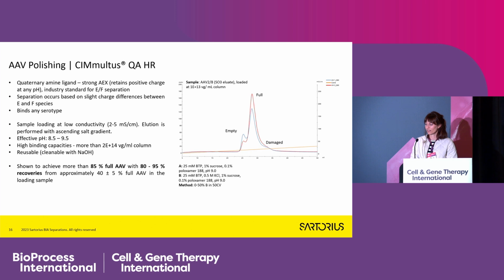Usually we try the ultracentrifuge, and it seems like it's of the same density as the full. Mass photometry also shows partial empties and partial fulls, so it's not yet clear, but maybe the deamidation hypothesis is the most probable one.